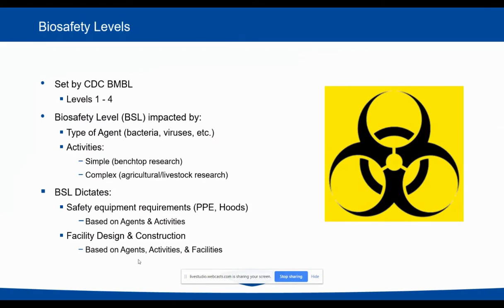So one of the other things I just want to hit on real quick, you'll see in some of the slides, are just a mention of biosafety levels. Now, on the slide I mentioned that the designations come from the CDC with respect to the levels and requirements for different types of measures to keep a laboratory safe.